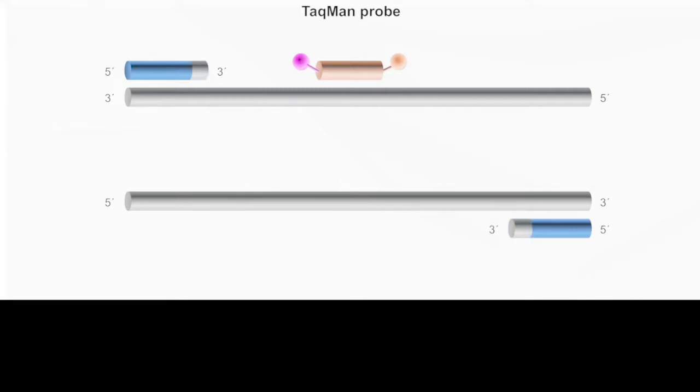Now, you don't have to use this specific probe. Some people may just use a double-stranded DNA binding dye.